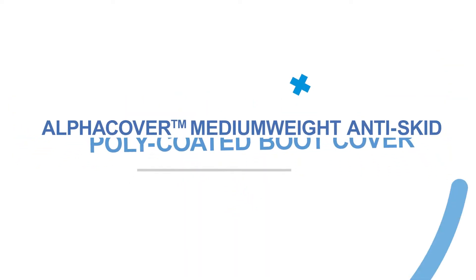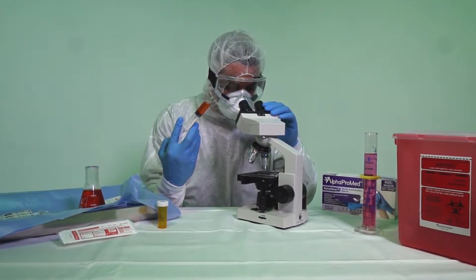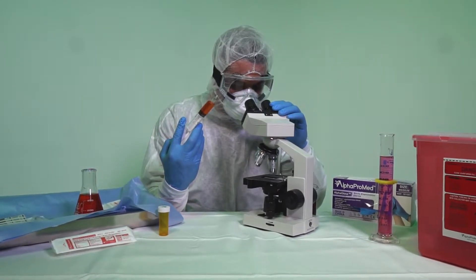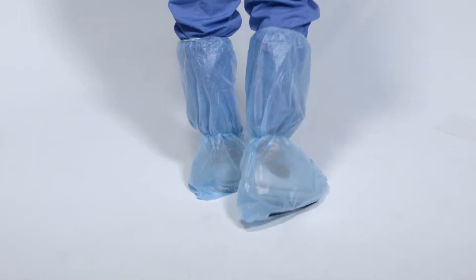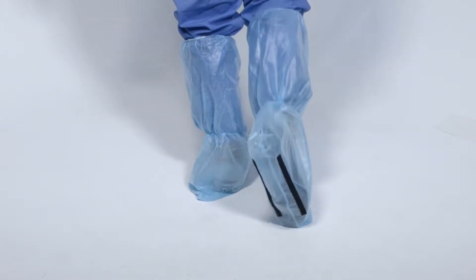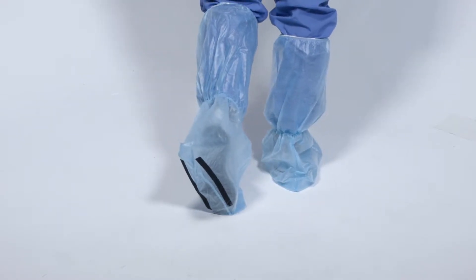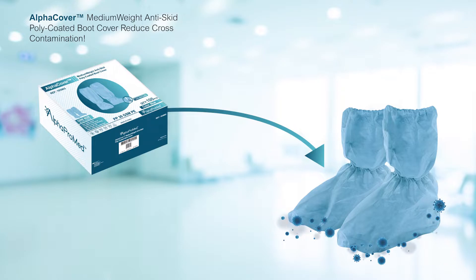The Alphacover medium-weight anti-skid poly-coated boot cover is your number one solution for preventing cross-contamination and is a key pillar of any infection control strategy. Alphapromed has designed a superior knee-high boot cover specifically focused on protecting the feet, shins, and knees from hazards in medium to high-risk procedures in the OR or the lab.